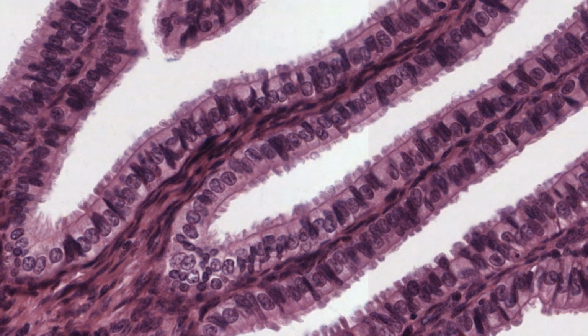Now let me try and remember my opening remark when I first showed you this image. I think I said something like, here is an example of a simple columnar epithelium with cilia lining the uterine tube. Do you really think this is simple columnar epithelium?